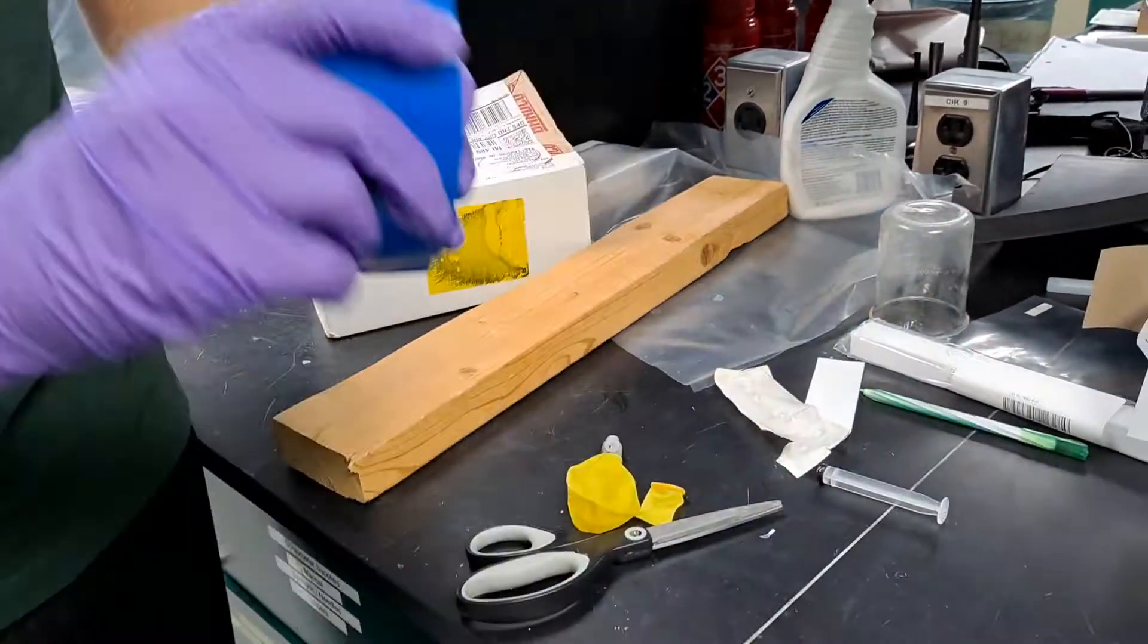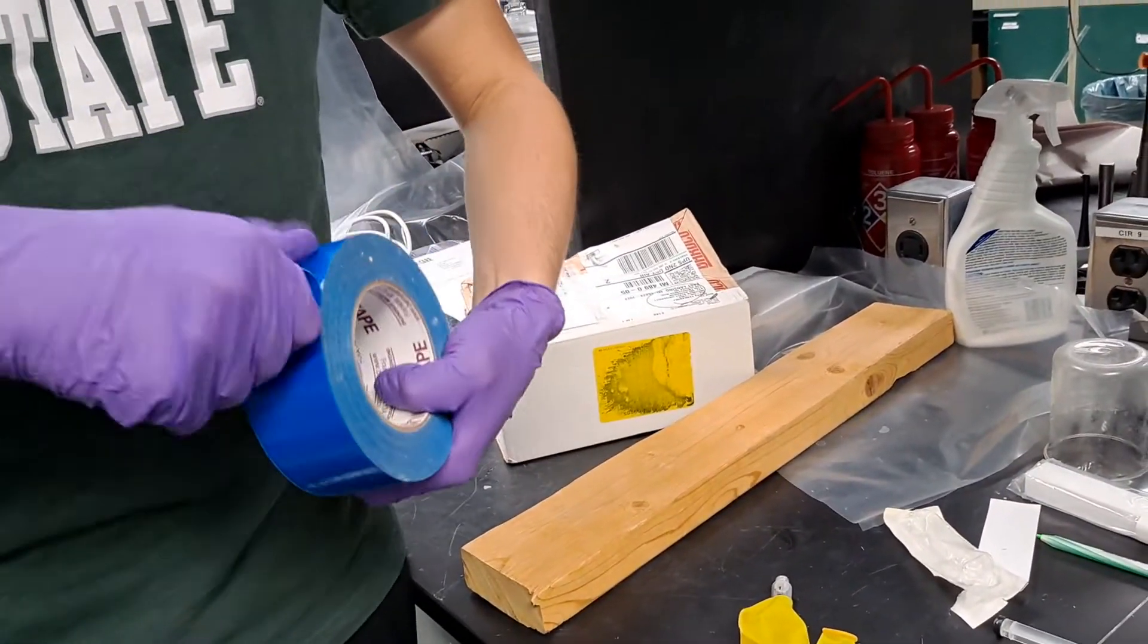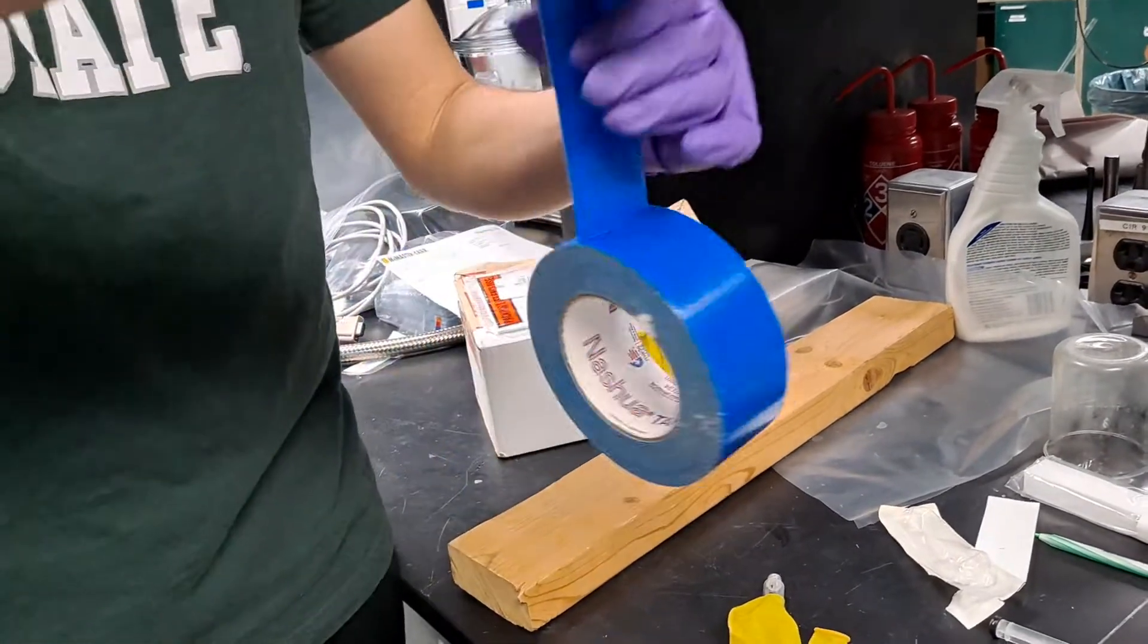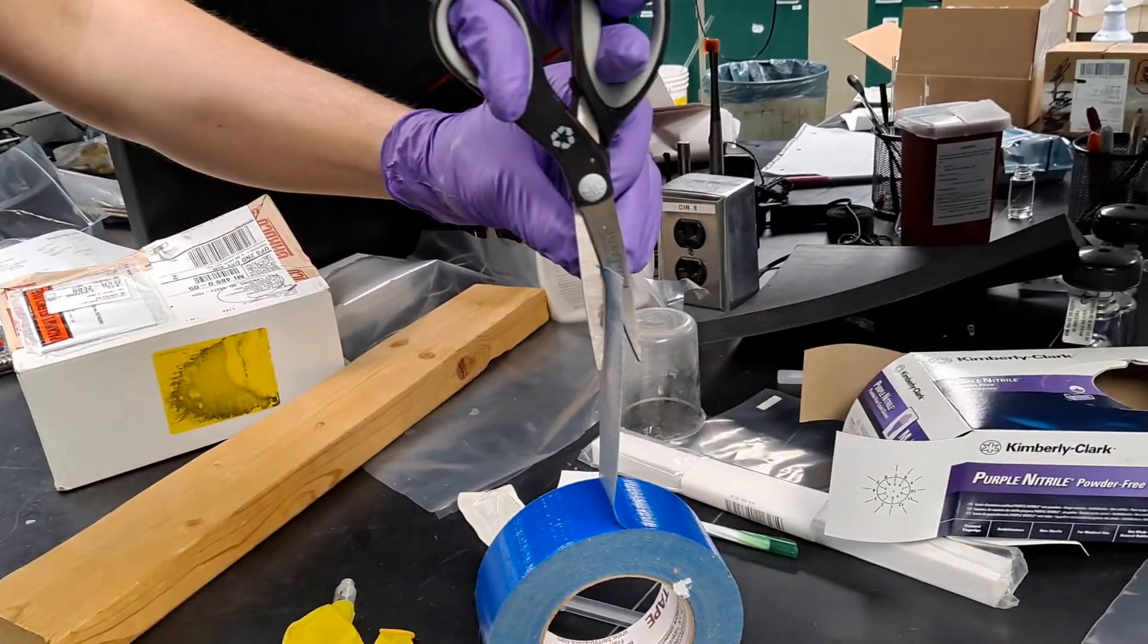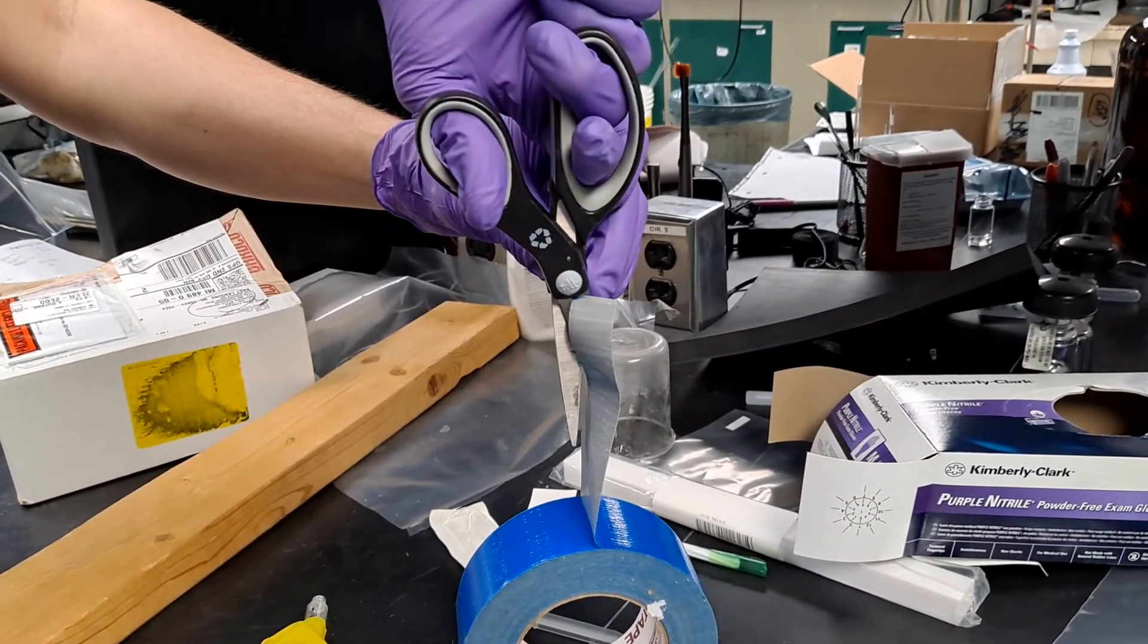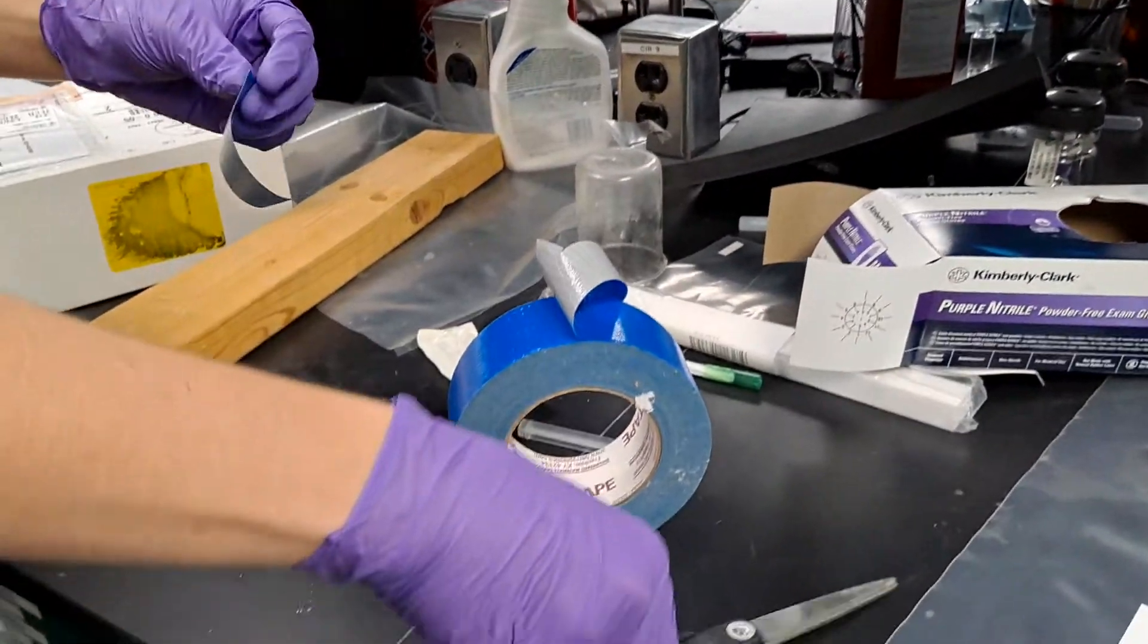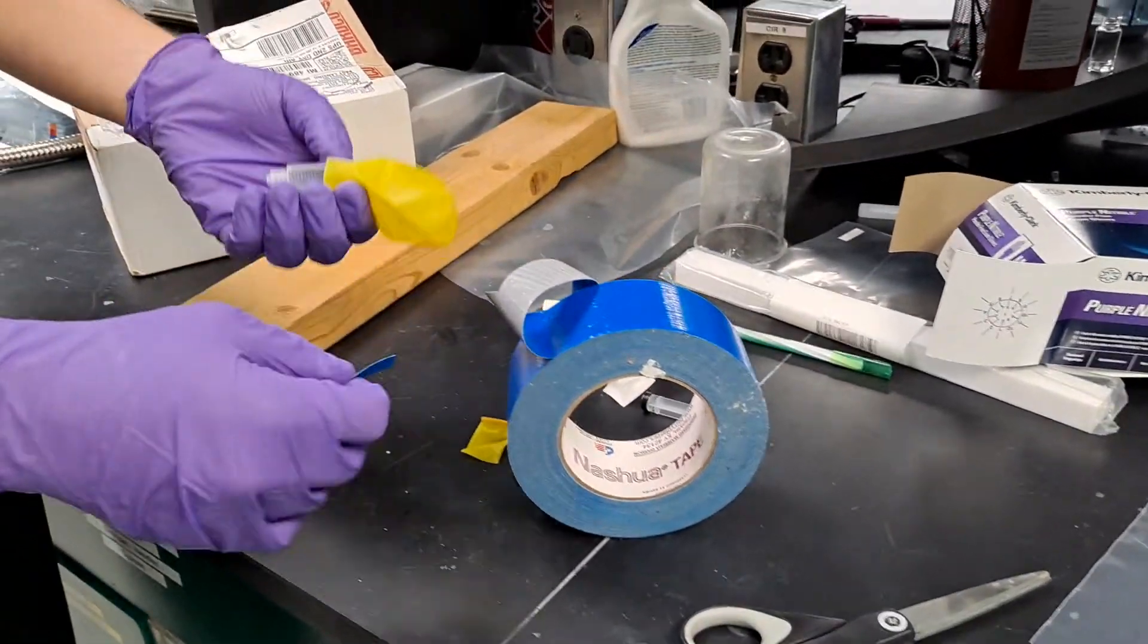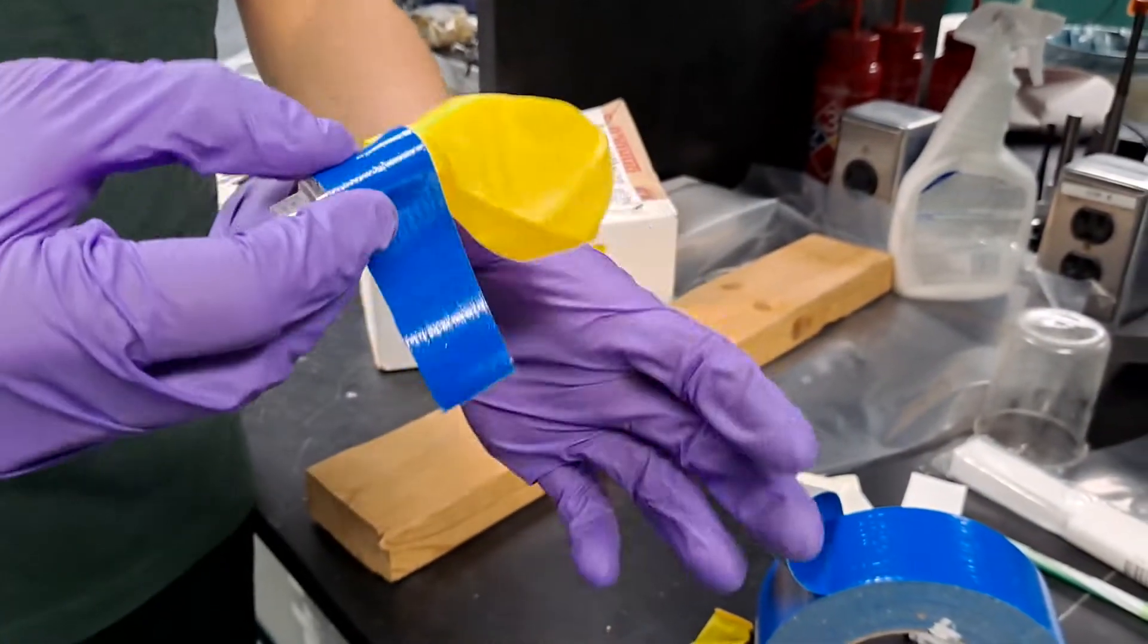And then the next step is to seal it. So what you do is take some duct tape, and a thinner strip usually works. You wrap it around and make sure you get a good seal on it.